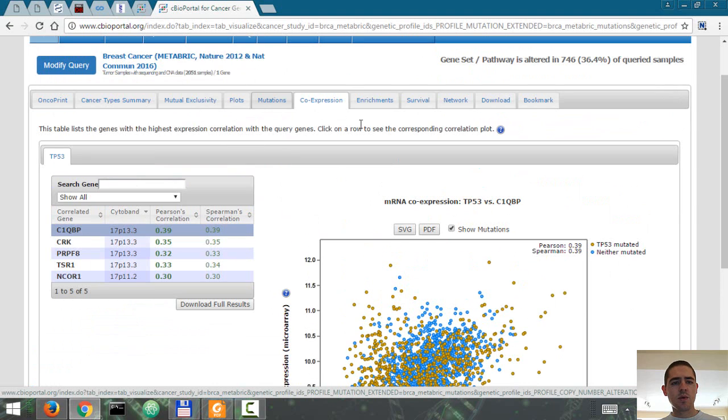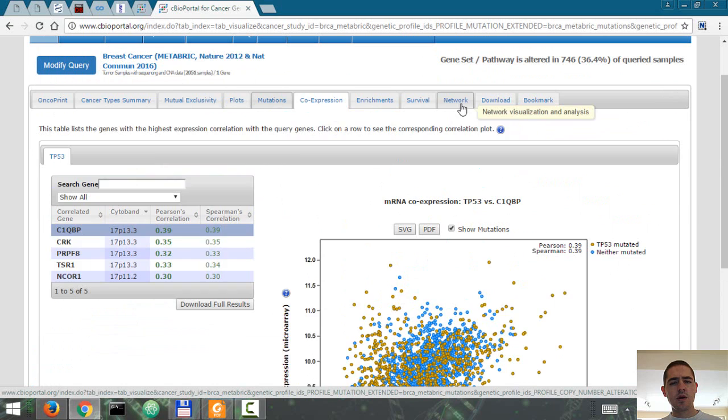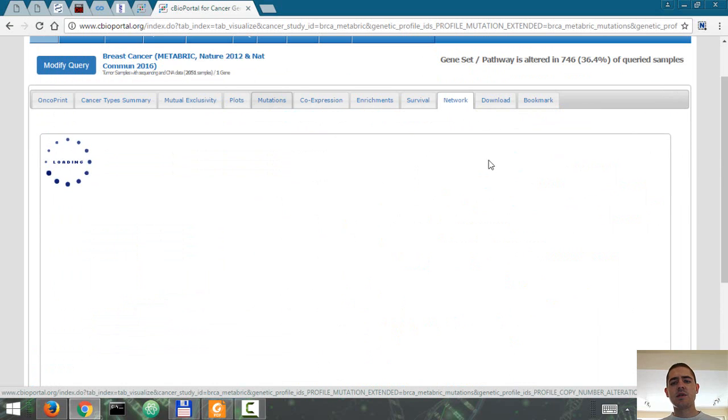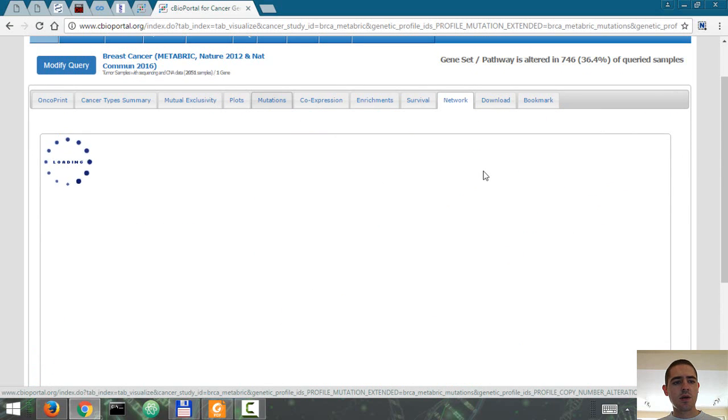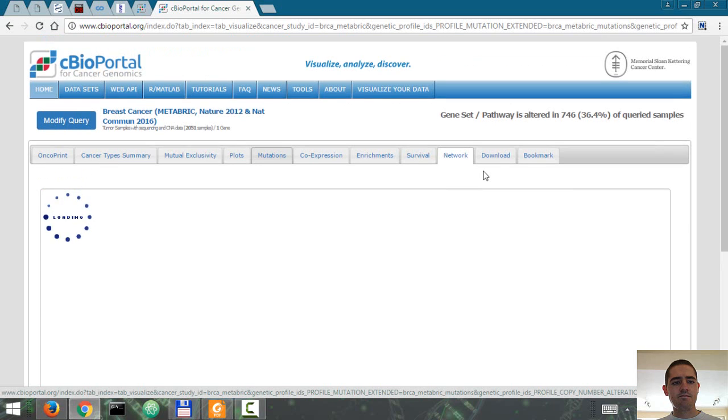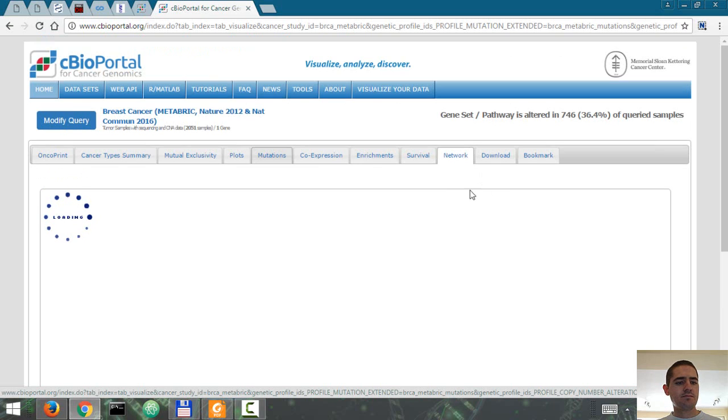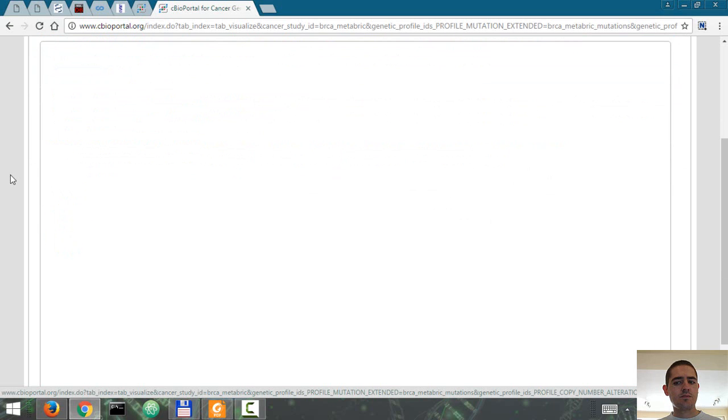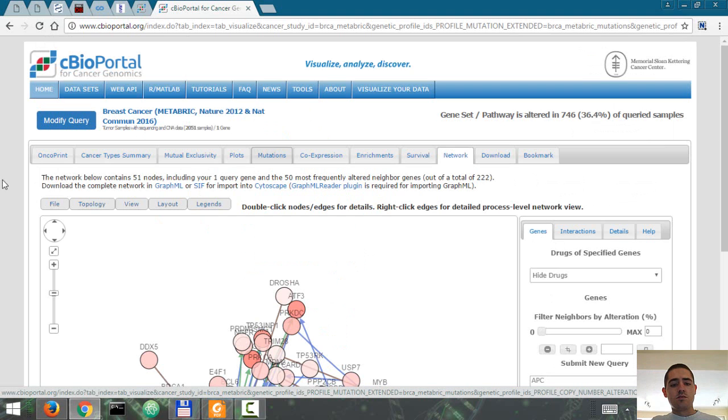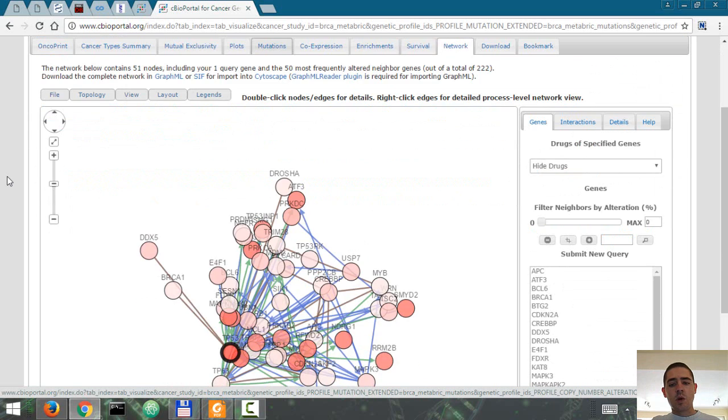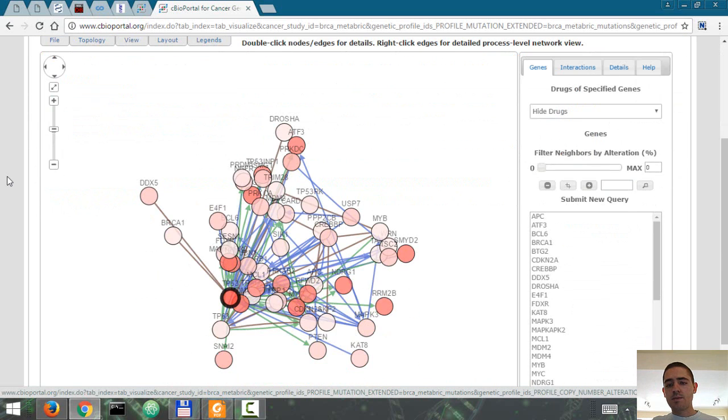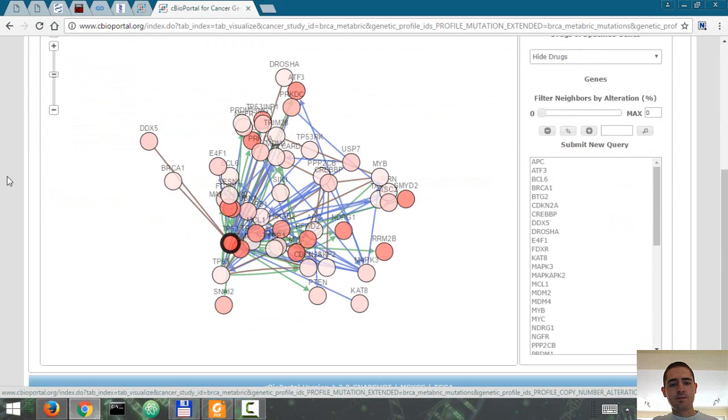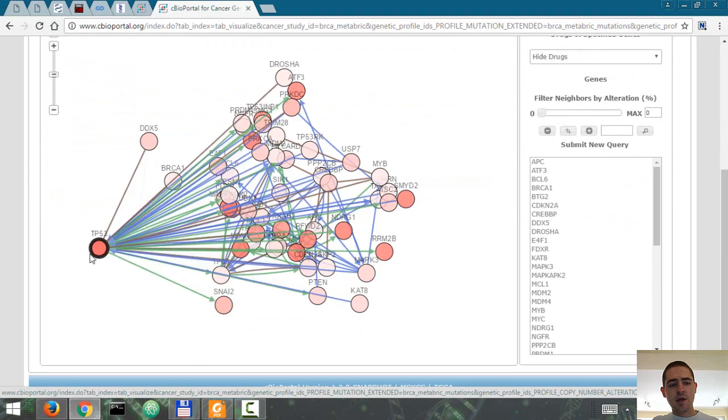It wasn't here. I think it was the network, network visualization. Alright, so here's P53.